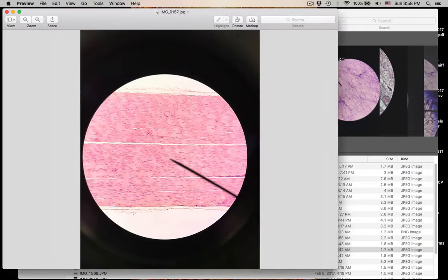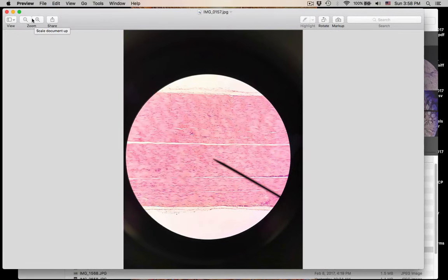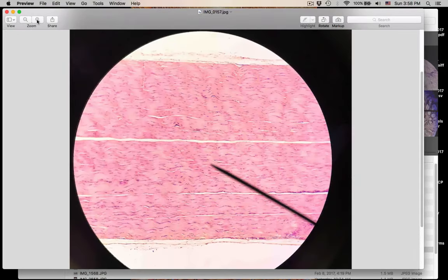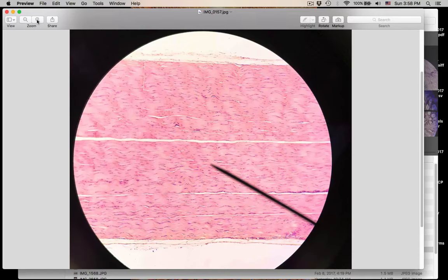Here's another slide — we're seeing this one a lot, and we've got some good ones here. The name of this connective tissue is number fifteen. The second part of this question: where do you find this connective tissue in your body? That was number fifteen — the name of this connective tissue, and where do you find it?